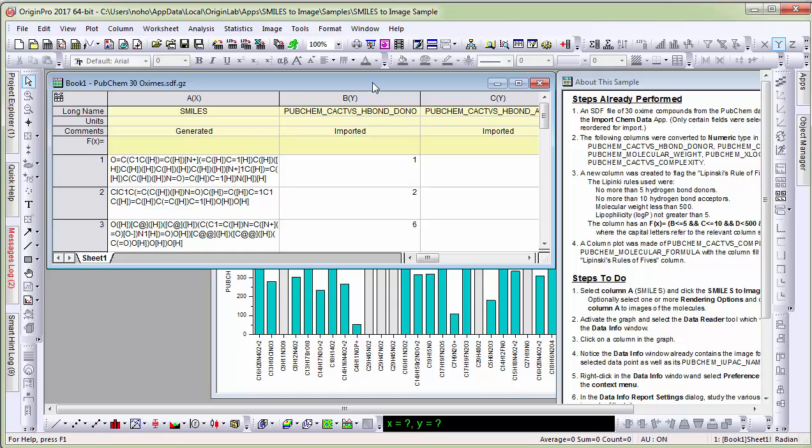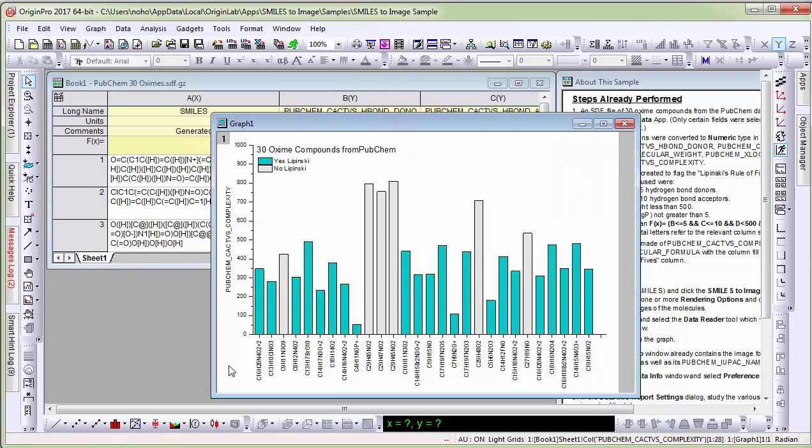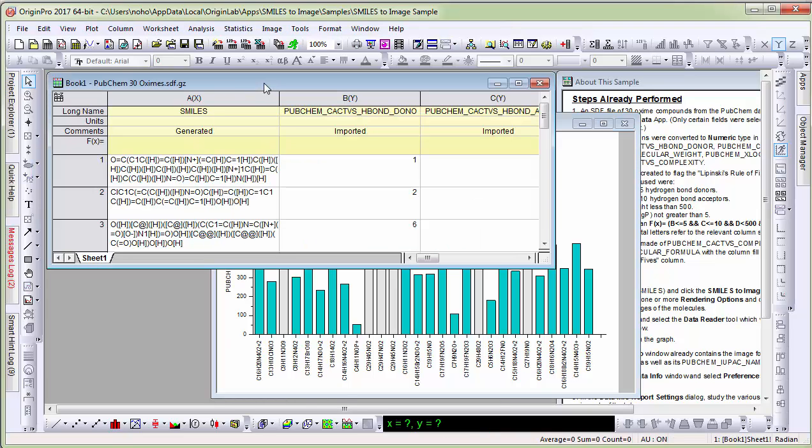Of these several columns, a couple of columns have been plotted as a graph in this project. The first column contains the smile string.